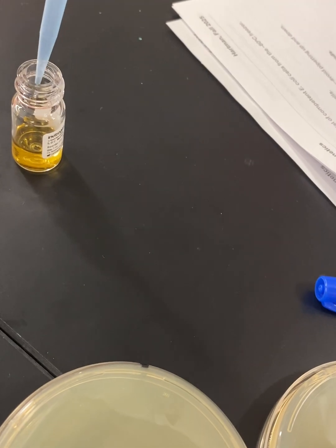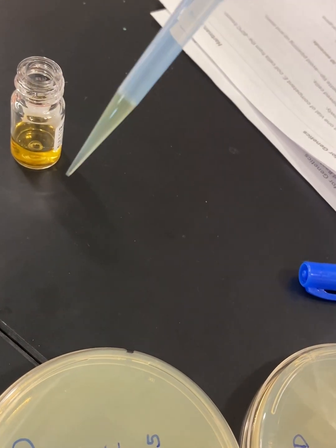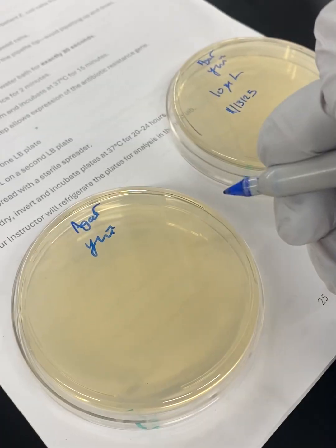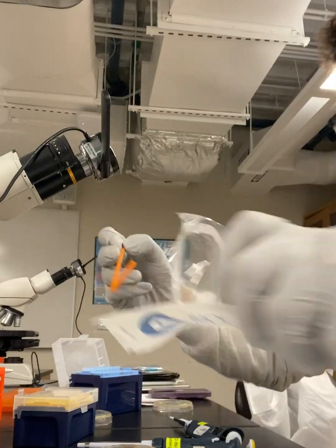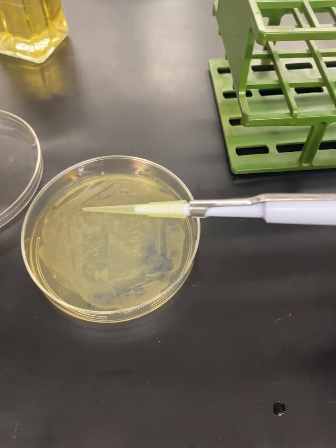To allow the bacteria to recover, we add 250 microliters of SOC medium and incubate the cells at 37 degrees for 1 hour. Shaking gently helps the cells express the ampicillin resistance gene. Once recovery is complete, we plate 10 microliters and 100 microliters of the culture onto LB plates containing ampicillin and X-gal. We incubate them overnight, and there's the culture.